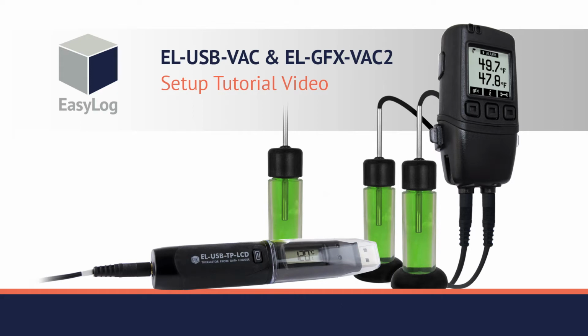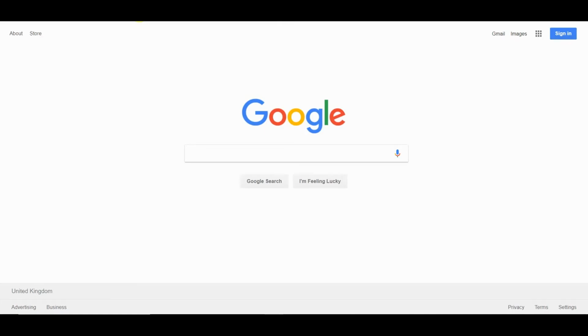In this tutorial, we will go through how to set up your USB or GFX vaccine data logger. Before we start, you need to download and install the EasyLog USB software.